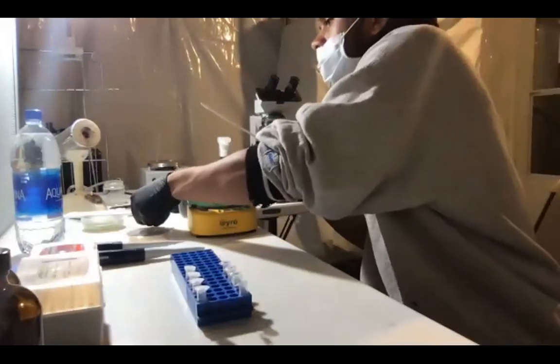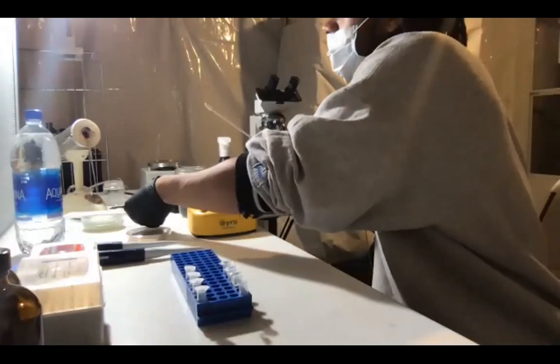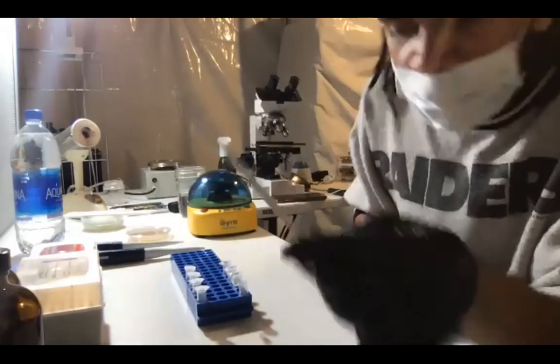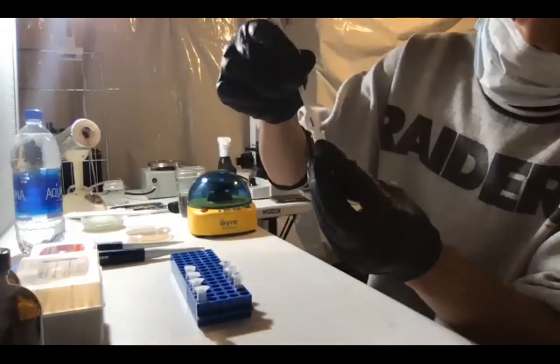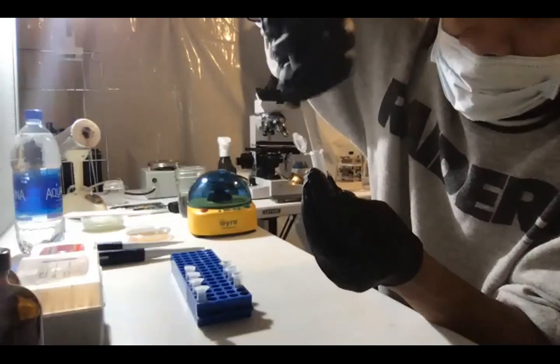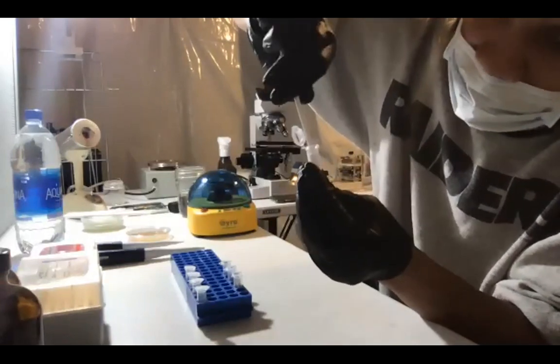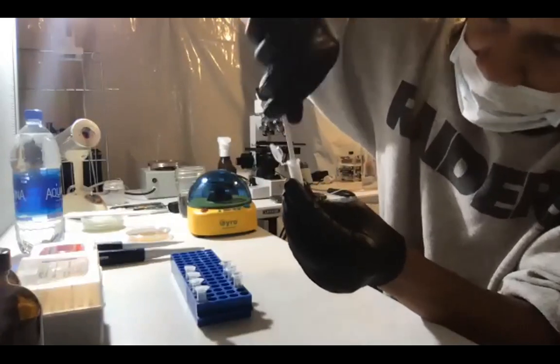I'm gonna take my little pestle here, and I'm gonna grind this into the extraction liquid. Because this is just mycelium on agar, it'll grind really, really easily. So I'll just do this for like 10 seconds. Just make sure you mash it up. You want all the cells to break open so the DNA will come out into the extraction liquid.